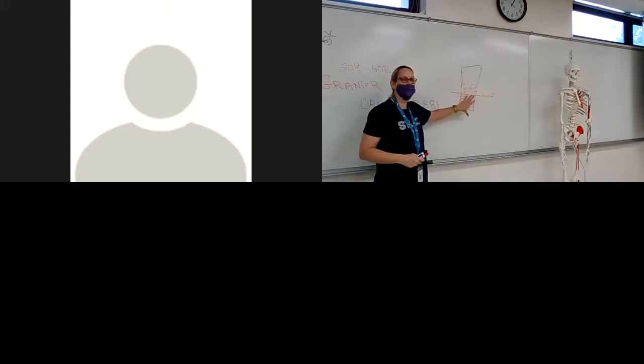One of the first things we do with whole blood is we centrifuge it. By centrifuging it, you spin and everything moves to the outside based on weight, like in the scrambler ride. So the heaviest things drop to the bottom. Then this imaginary line where we see the fluidy part and the real thick formed element part, that line we tend to call the hematocrit.